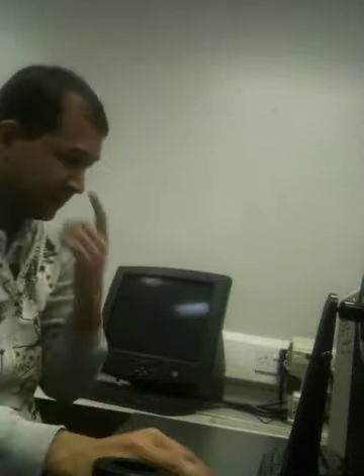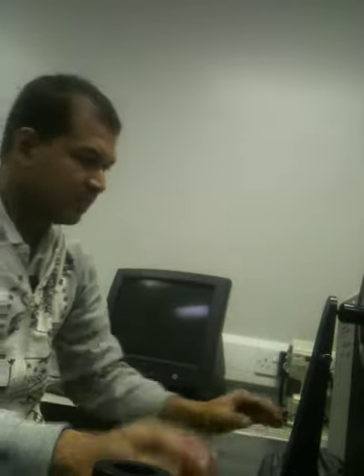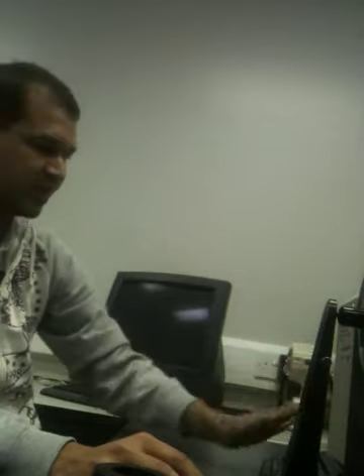That's fine. Okay, now let's go for the calibration. So this is the Datacolor spectrophotometer. The software is from Datacolor as well. This is an American company and a very famous one.